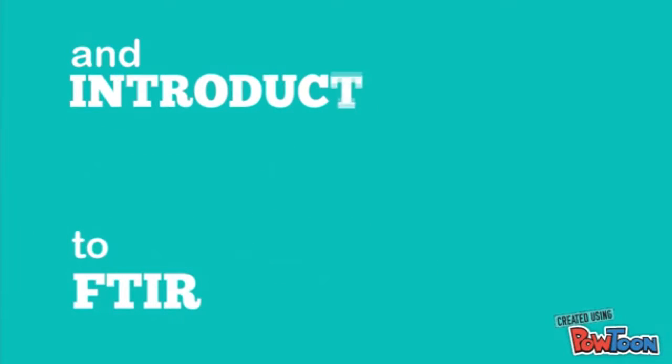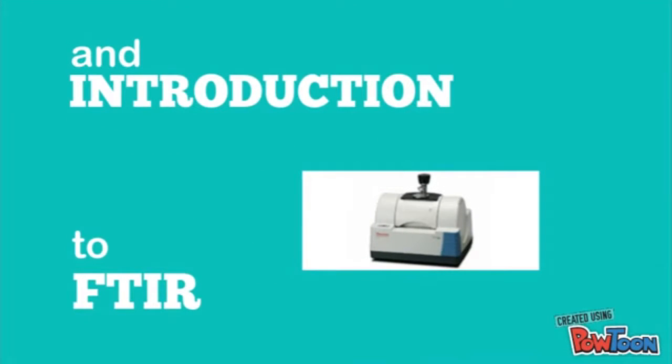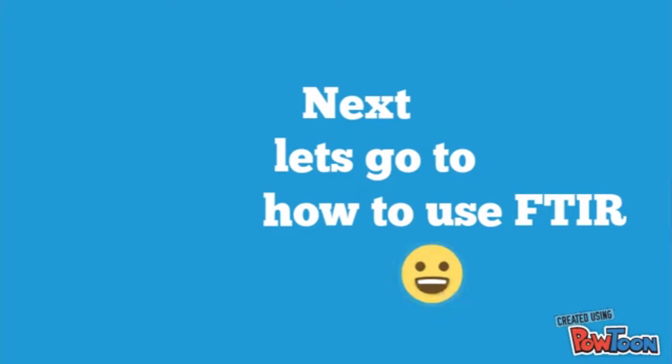For an introduction, Fourier transform infrared spectroscopy, FTIR, is a technique used to obtain an infrared spectrum of absorption or emission of a solid, liquid or gases. So now, let's go next.